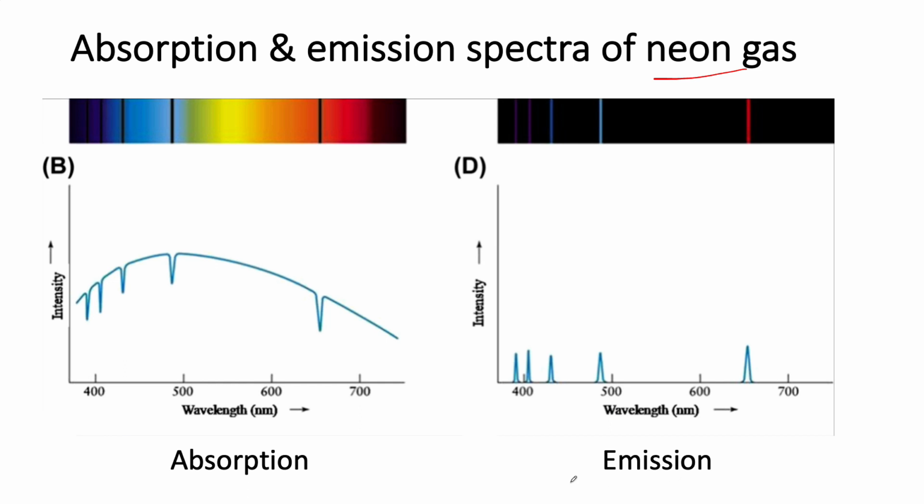Okay, and for instance, if you looked at this absorption spectrum, you could use the depth of this dip to give you an idea of how much gas you had in there. If you've got more gas, this dip here is going to be deeper, right? And it's going to follow Beer's law, depending on what the concentration is for that particular species, and also depending on the path length, whether you're going through just a millimeter of gas or a centimeter of gas. The longer the path length, the more absorption you're going to get. And that's all built into Beer's law.